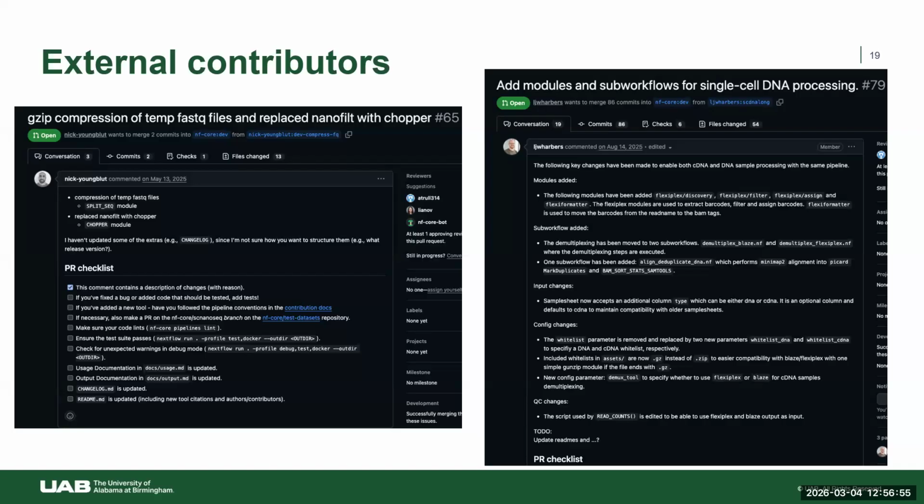And then the second PR is something that will likely be coming in later down the line, but someone is actually working with us to add this, which is to add single-cell DNA processing support. So if you want to do both RNA or DNA, that may be something that is in scnanoseq in the near future. So we're heavily invested into this one, and Luke, who is the developer for this particular PR, continues to work on that quite often as well.